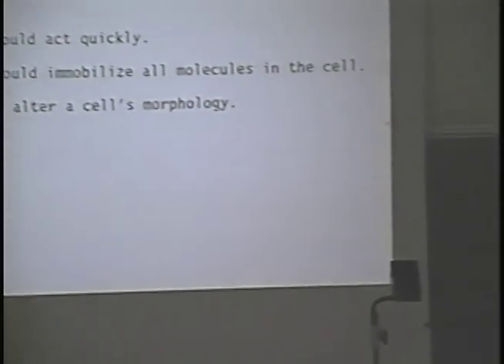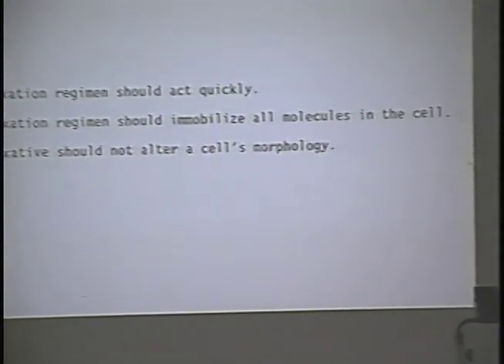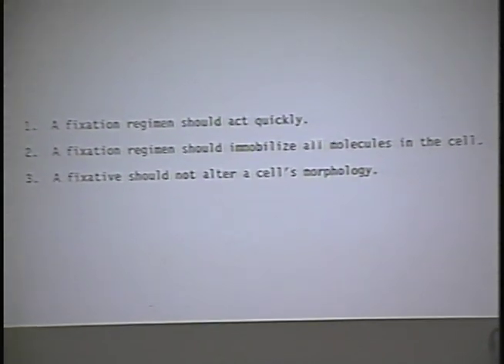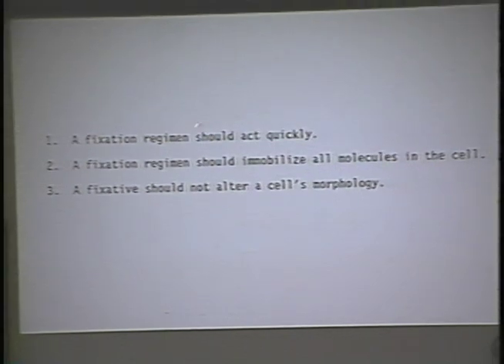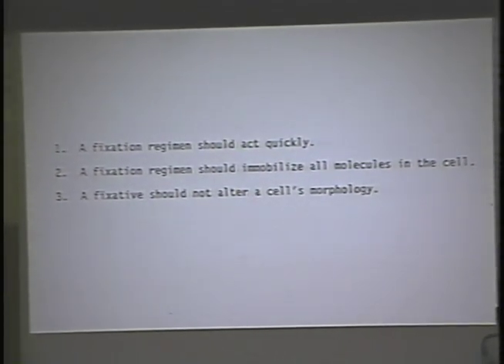First of all, why cryofixation? Well, one can think of at least three criteria which must be satisfied for the optimum fixation of biological tissue. First, the fixation regimen should act quickly and immobilize all molecules and atoms in the cell. Third, a fixative should not alter a cell's morphology that was present before fixation. If I could have the next slide.